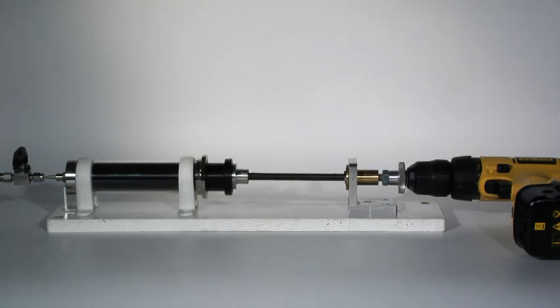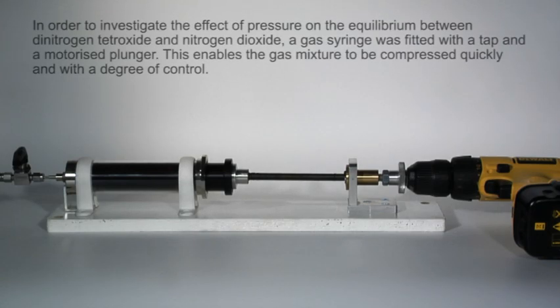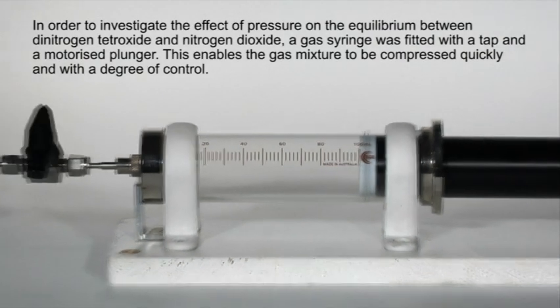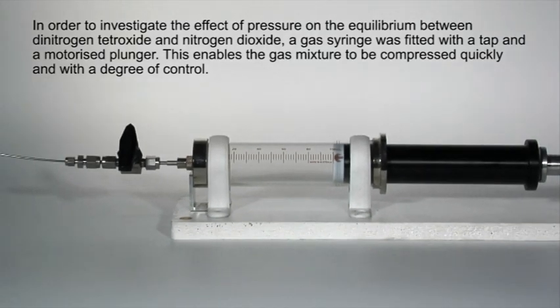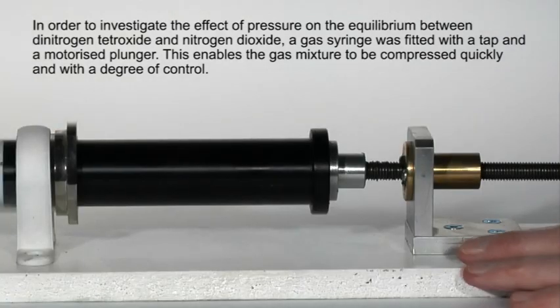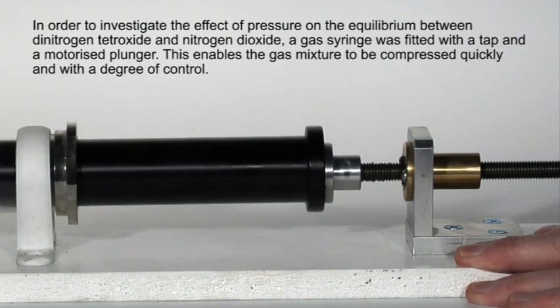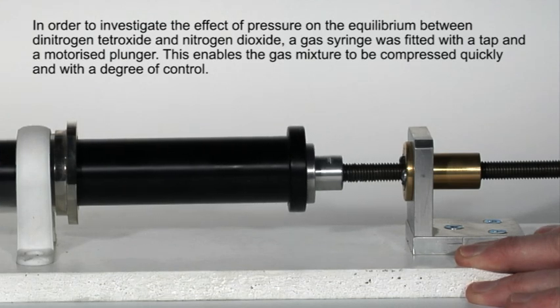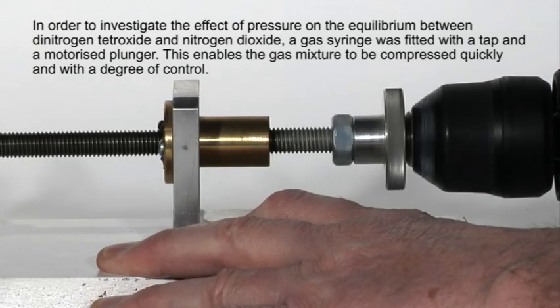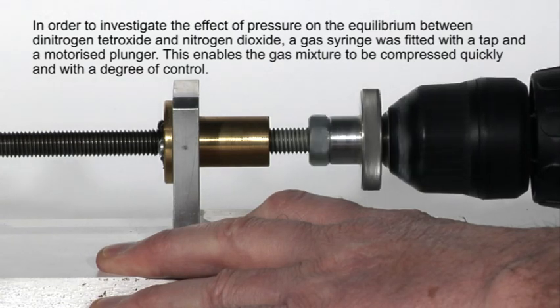The effect of pressure on the equilibrium between dinitrogen tetroxide and nitrogen dioxide can be followed by compressing a mixture in a gas syringe. An electric drill and a threaded rod allows the mixture to be compressed with a fair degree of control.